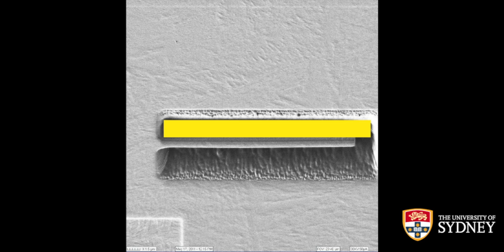Next step is fairly easy. You just do a cut that takes the bar that you've milled from above and cuts the backside of it so that it's freestanding underneath. Whether you cut the lift-out side first or later is actually optional. You can do that also just before you lift your bar out.